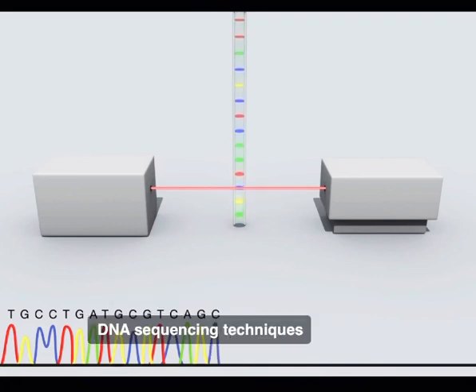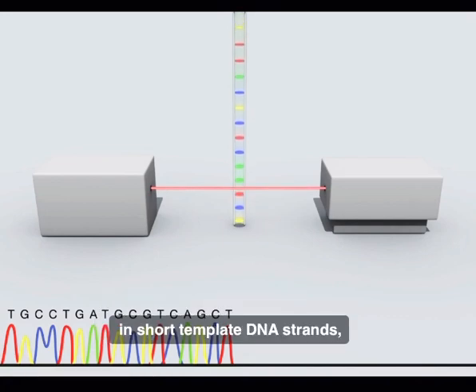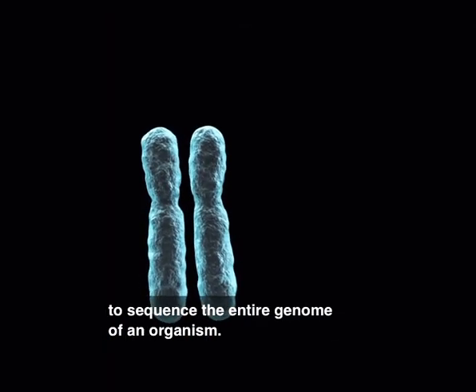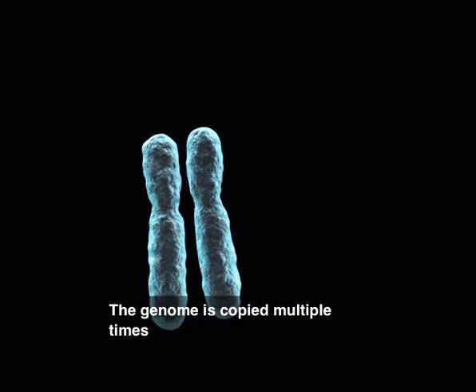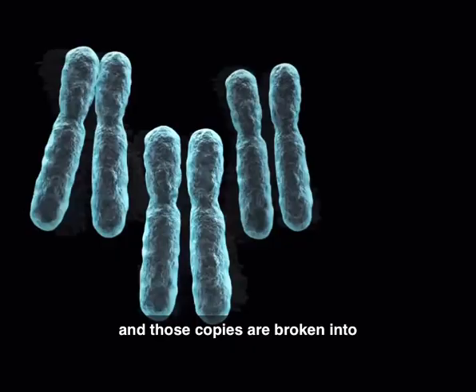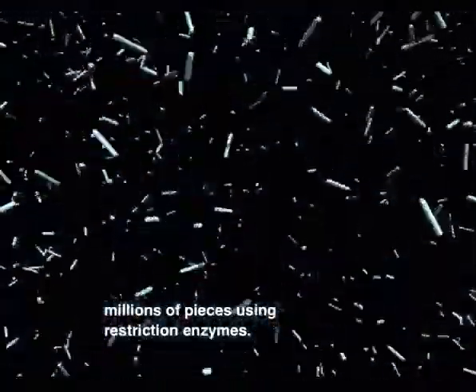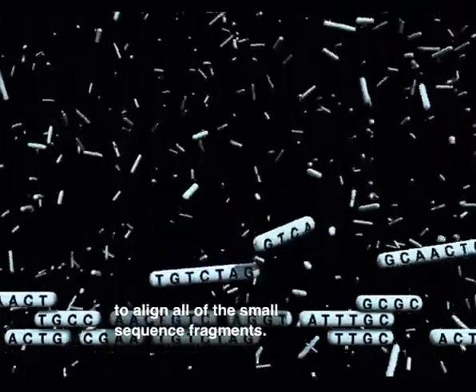DNA sequencing techniques are used to determine the identity of nucleotides in short template DNA strands, but the same techniques can also be used to sequence the entire genome of an organism. The genome is copied multiple times, and those copies are broken into millions of pieces using restriction enzymes. Computer software is then used to align all of the small sequence fragments.